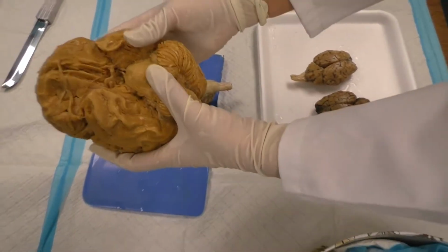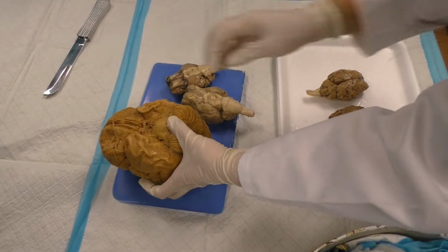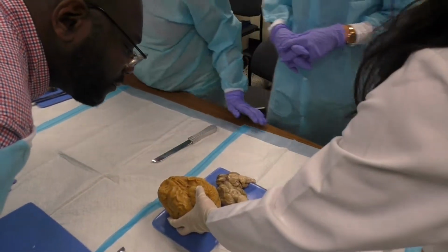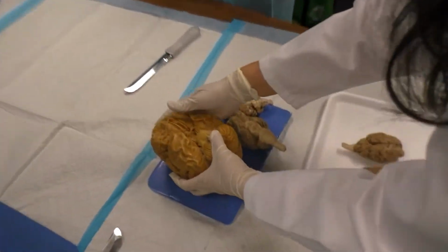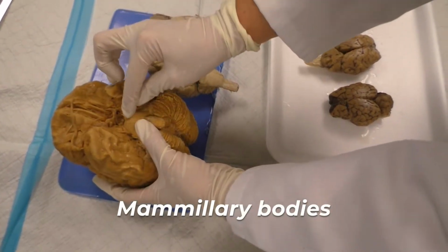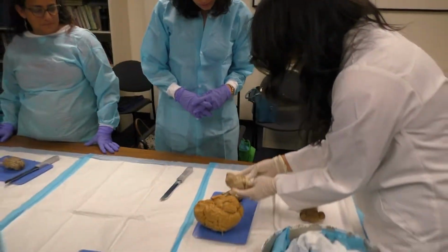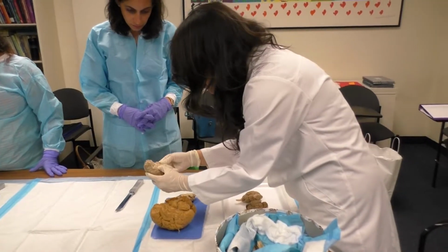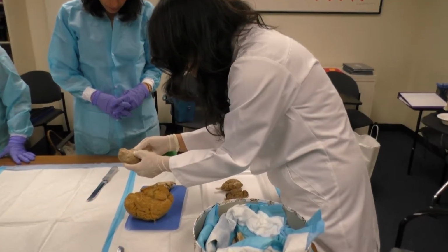The other thing that you can see really well, if you come and put your face over here and look down there, can you see 2 little bumps? Yeah. Is that the mammillary body? Yeah, mammillary bodies. There are those two little bumps right at the bottom there. And can you see it here? They tend to get squashed. Oh, but look, there they are.